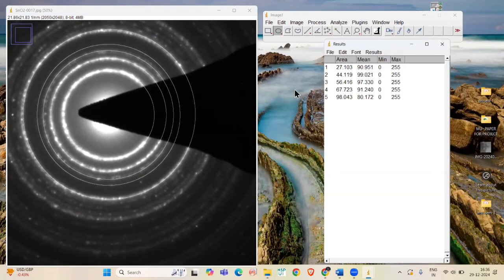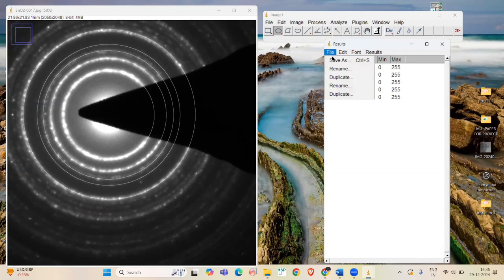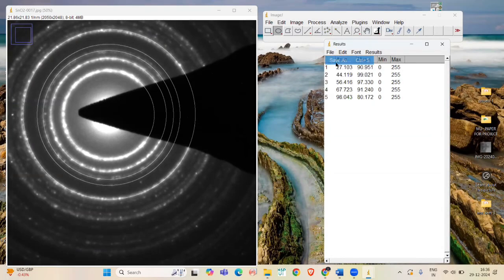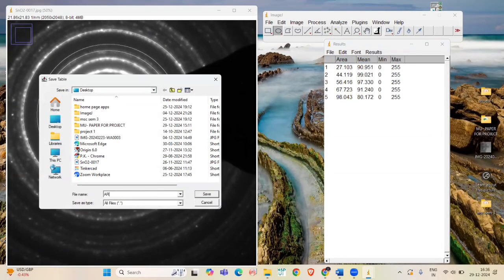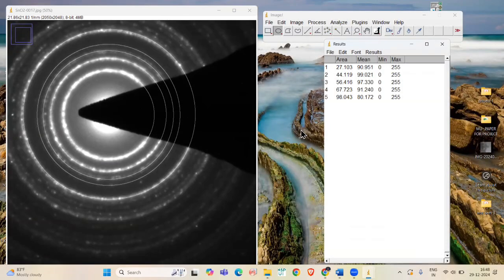Now, save the area measurements. Go to File and select Save As. Now, open the saved file.